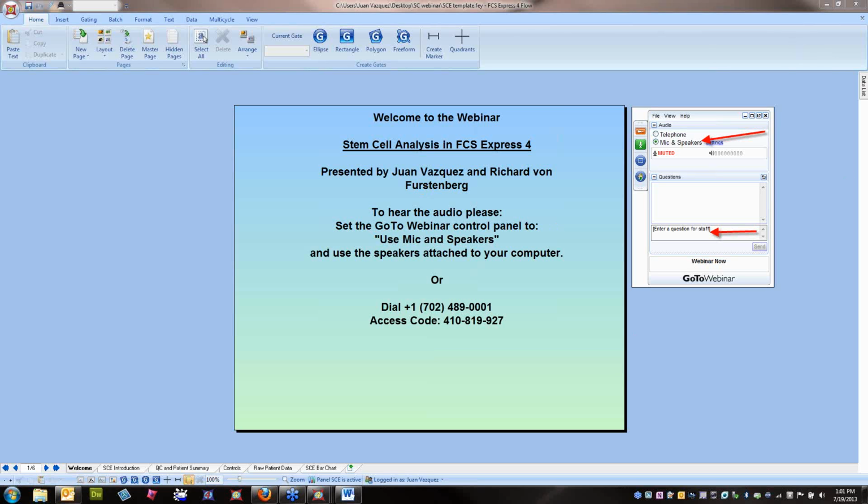I'm joined on the line today by Richard von Furstenberg from the University of North Carolina, Chapel Hill. We'll be discussing side population analysis and CD24 analysis in intestinal stem cells. Before we start, I'm going to be focusing on stem cell enumeration specifically.